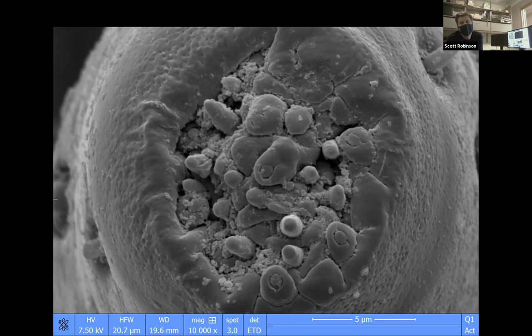Get x-ray images of his samples. People are building things out of materials, really small things out of materials, and they want to see how well they did. And some people are biologists and they want to see what something looks like up close that has to do with biology, and that's why we would use a scanning electron microscope.